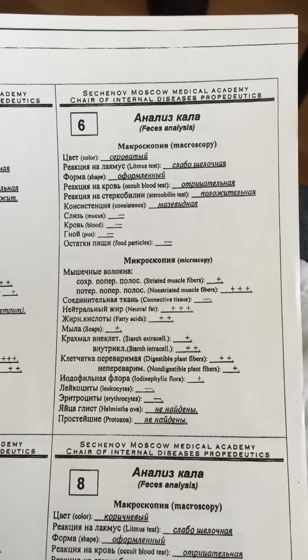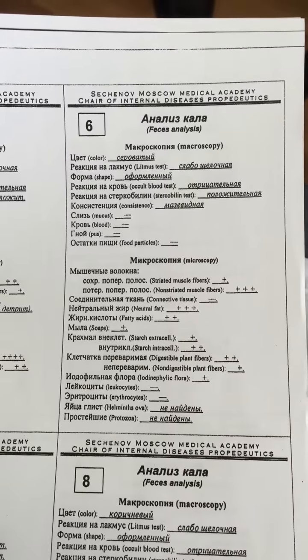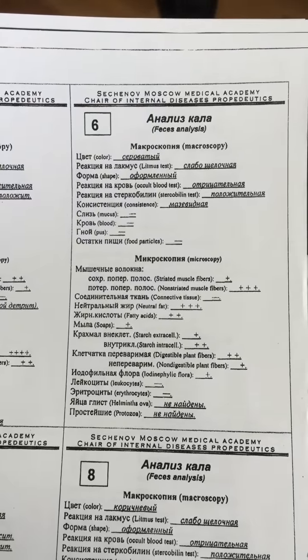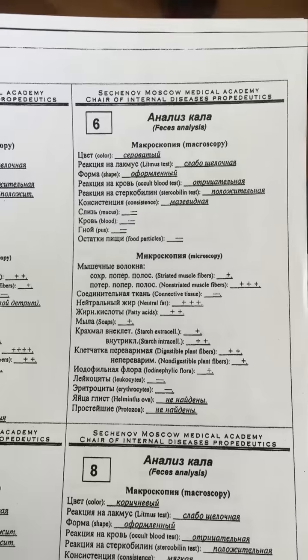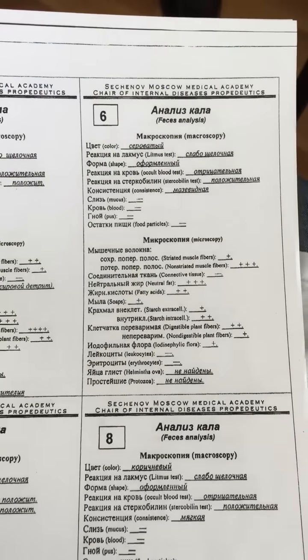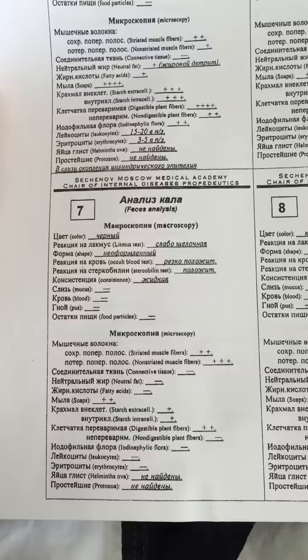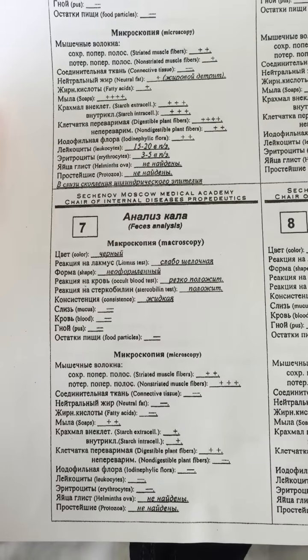You had already seen such analysis: a lot of non-striated muscle fibers, a lot of neutral fat, fatty acids, and starch. Also pancreatic insufficiency.